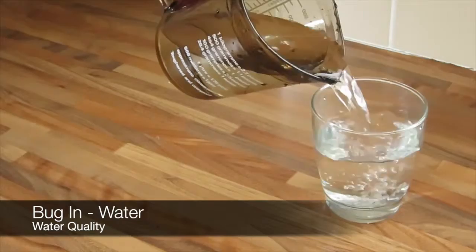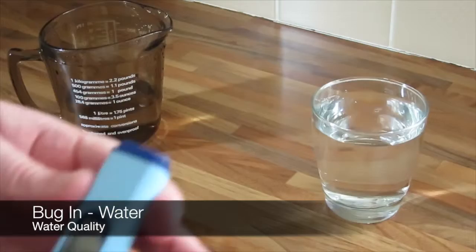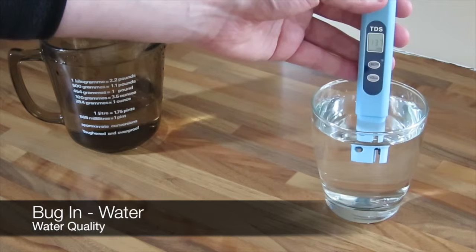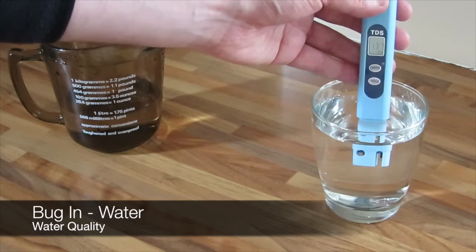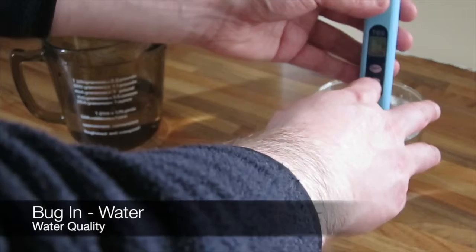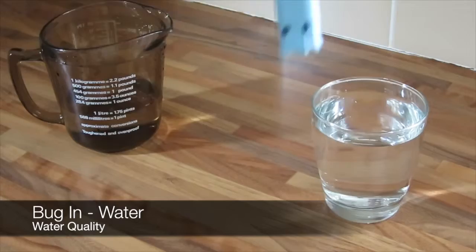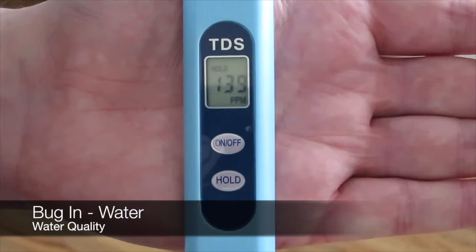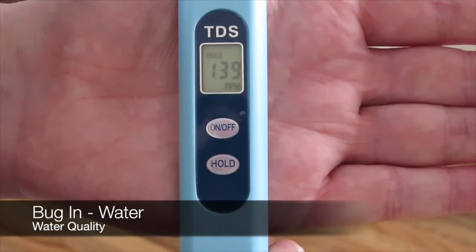So what we do is just pour the water into the glass here, switch on the TDS meter, and then we just put it in for about 10 to 15 seconds. Once the reading is settled, press the hold button, and that allows you to remove it from the water and view the reading. It says 139 parts per million, which is adequate.